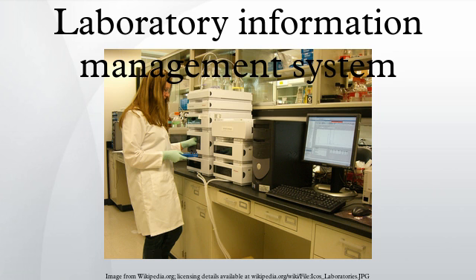Distinction between a LIMS and a LIS. Up until recently, the LIMS and Laboratory Information System have exhibited a few key differences, making them noticeably separate entities. A LIMS traditionally has been designed to process and report data related to batches of samples from biology labs, water treatment facilities, drug trials, and other entities that handle complex batches of data. A LIS has been designed primarily for processing and reporting data related to individual patients in a clinical setting. A LIMS may need to satisfy good manufacturing practice and meet the reporting and audit needs of the regulatory bodies and research scientists in many different industries.